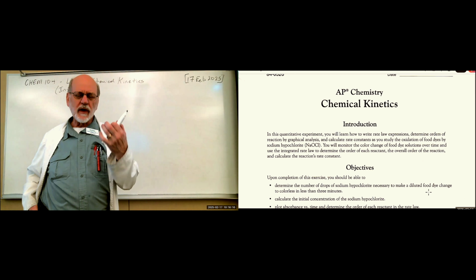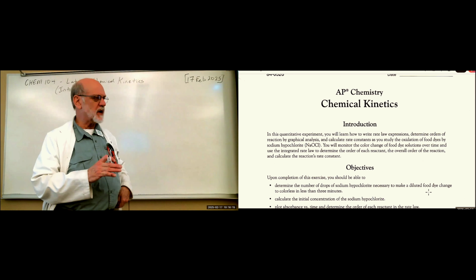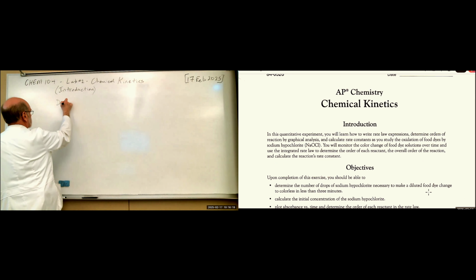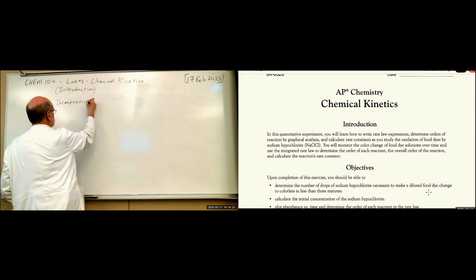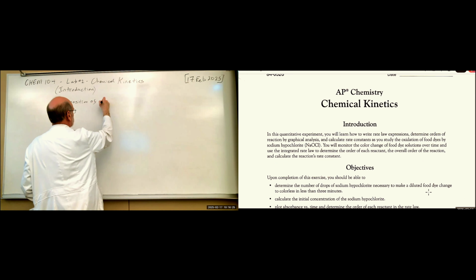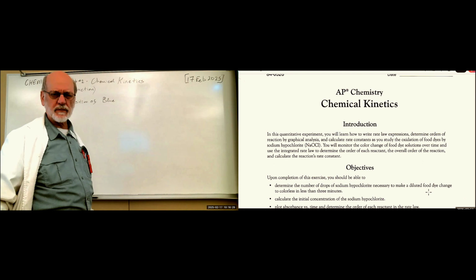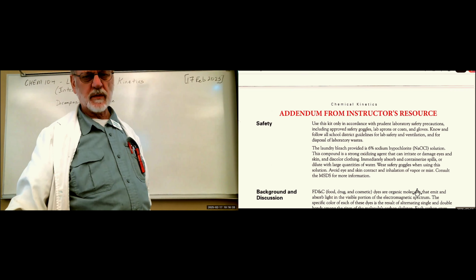We're going to study rate laws, chemical kinetics, in terms of the decomposition of blue. Let's see, which one is it? Blue number 2.